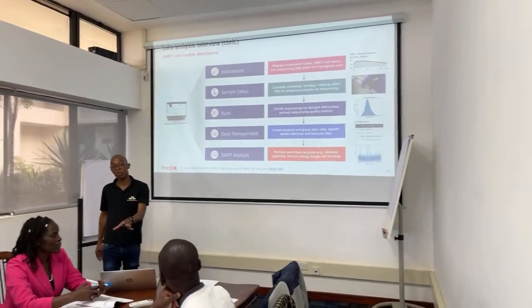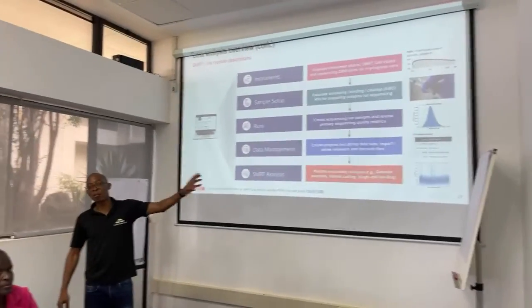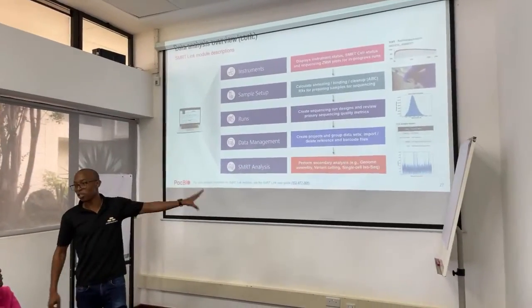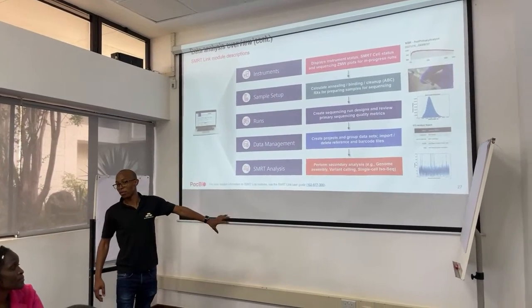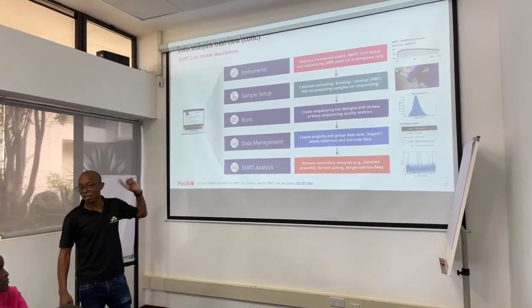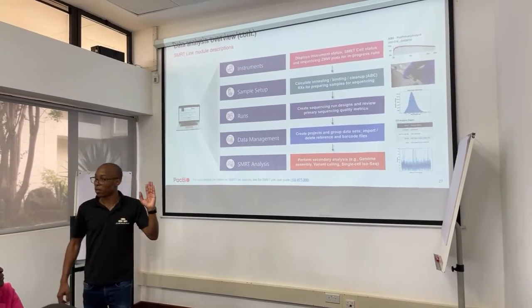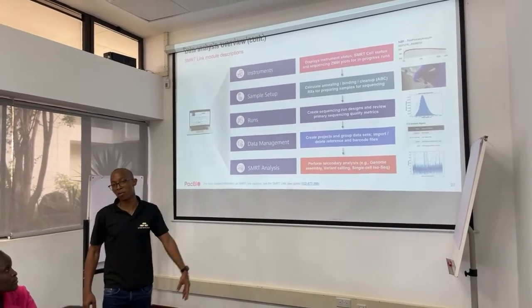This is all done on your laptop in your office, right? Because you access the machine from different locations through the server. Analysis: if you've done amplicons, you can do demultiplexing from your laptop, but all of that runs through the machine. It's happening within the machine. You can perform your genome assembly, everything. There are different pipelines already set up for you based on different applications. The RNA sequencing and all of those are in the SMRT Link software. So it's a fully packaged software.